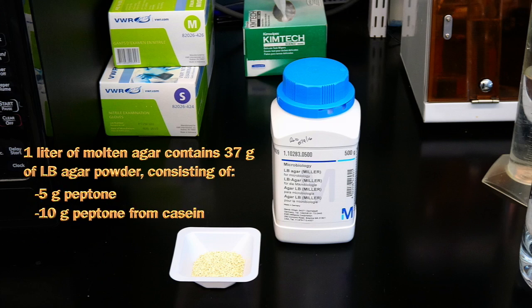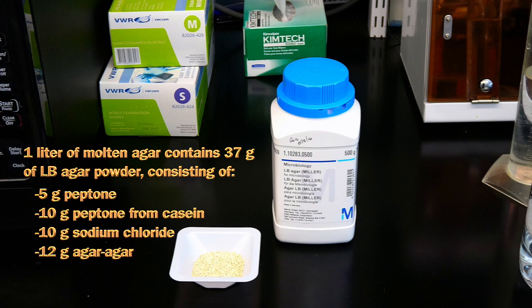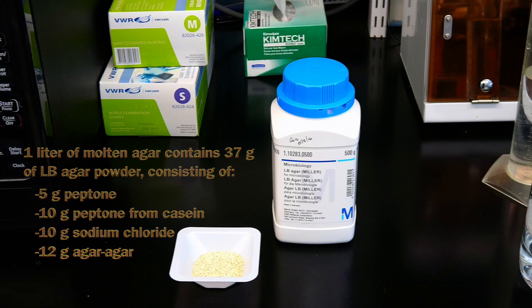10 grams of peptone from casein, 10 grams of sodium chloride, and 12 grams of agar agar. These items can be bought pre-mixed or you can buy each separately. We prefer to buy them pre-mixed to save time. This composition will make 1.2% agar plates.